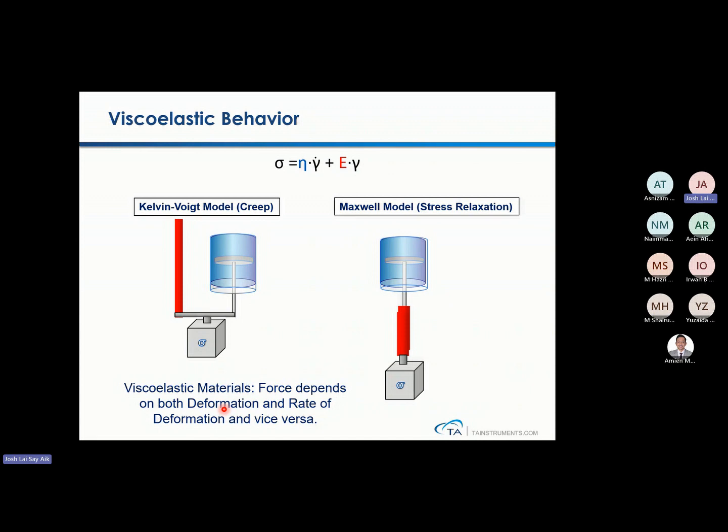After this, a tensile machine will give you a general strength, tensile modulus, but it does not know which part the modulus is actually coming from. Is it the elastic part or the viscous part? But a rheometer can tell you whether it's actually the viscous part that resists the movement or the elastic part that resists the movement. Okay?